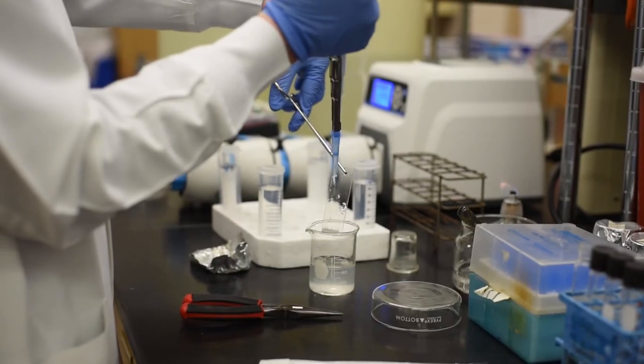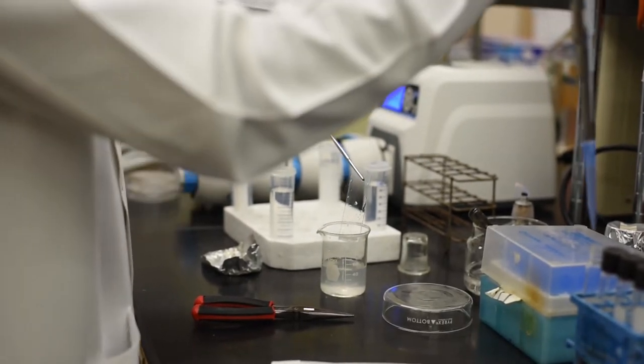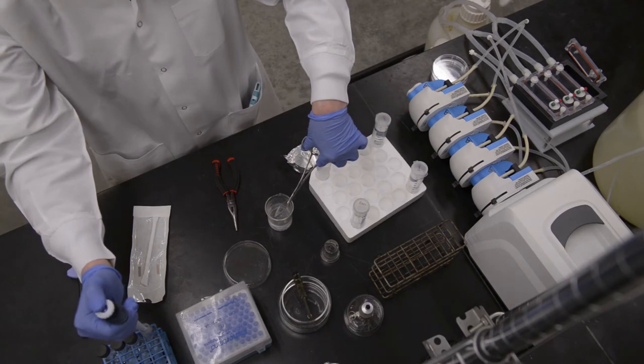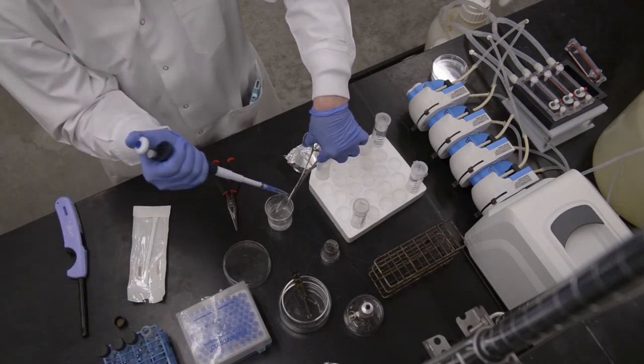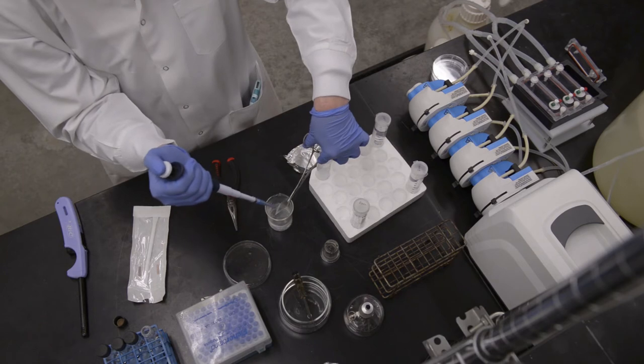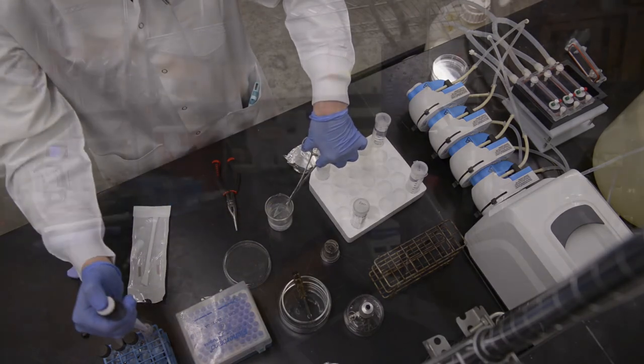Hold the slide at a 60 degree angle over the beaker and pipette five 1 milliliter volumes of sterile buffered dilution water over the slide surface. The total volume in the beaker is now 50 milliliters.